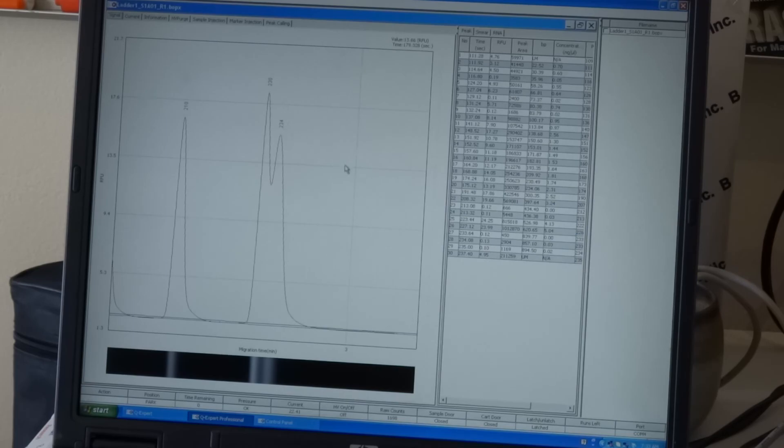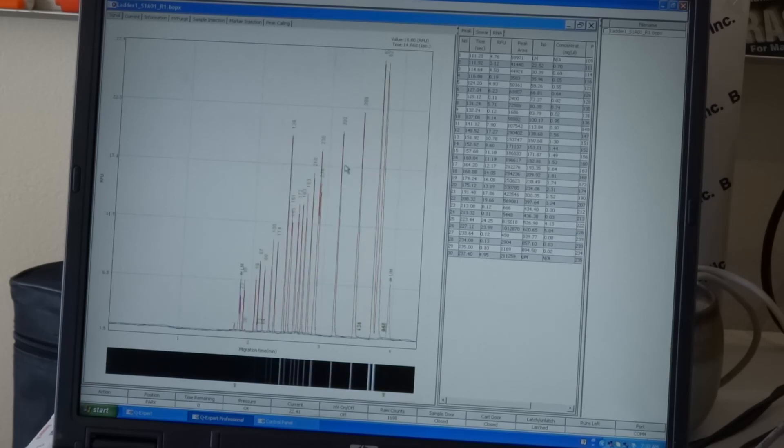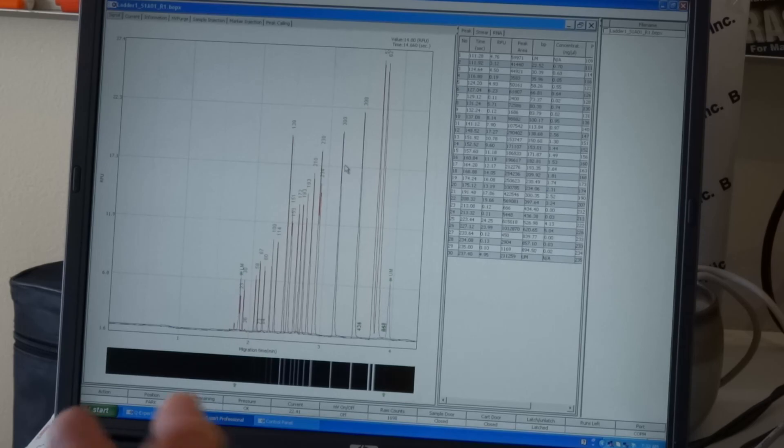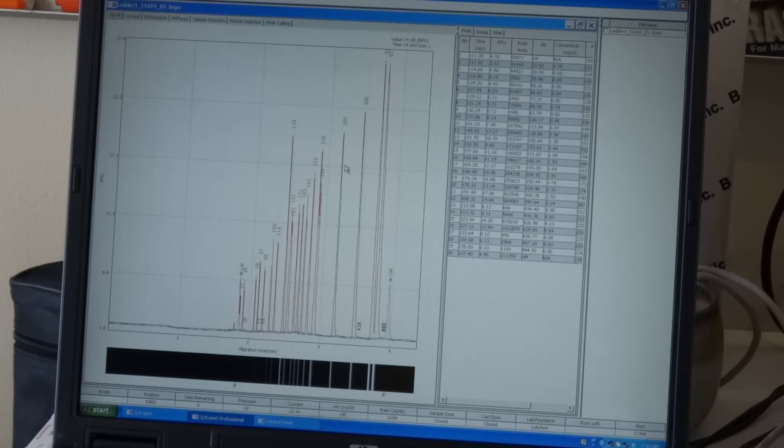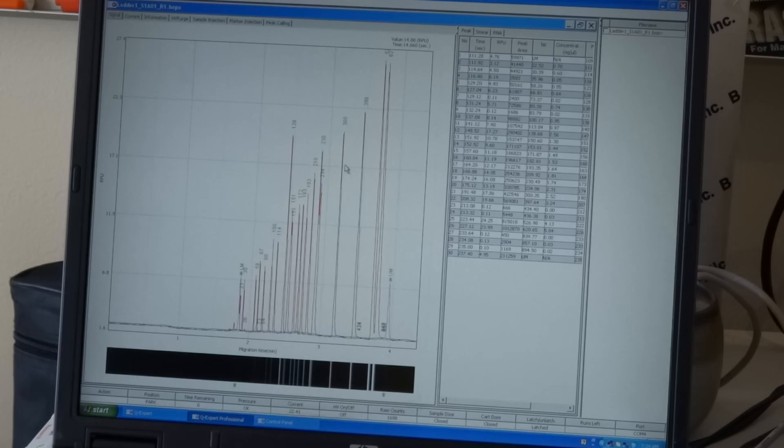So this is it. Now, after doing the ladder run, you are ready to put your PCR product and follow the same steps. Thank you.